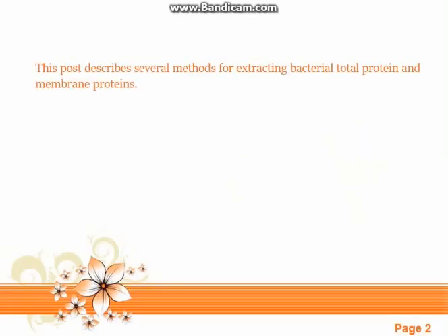This post describes several methods for extracting bacterial total protein and membrane proteins.